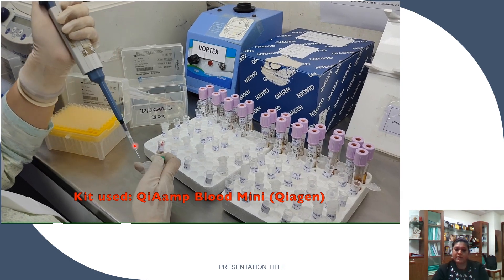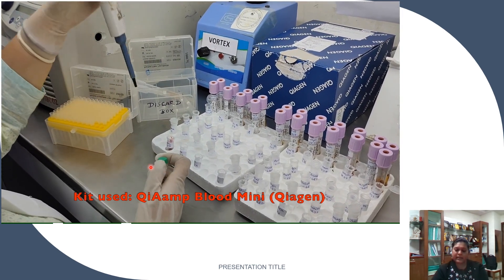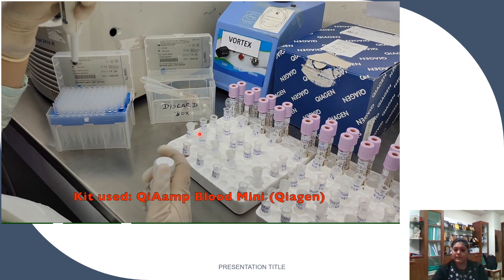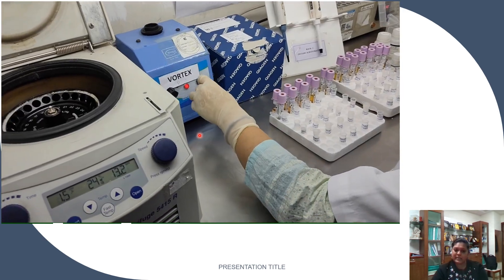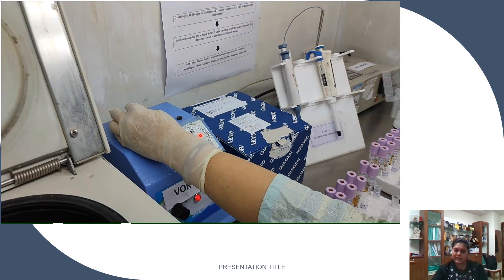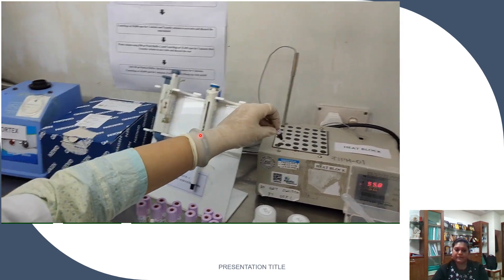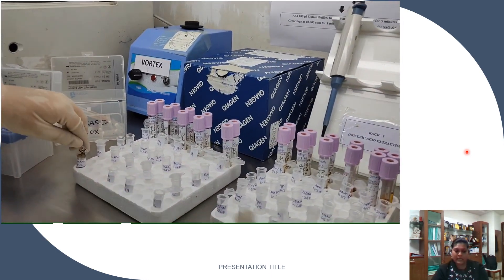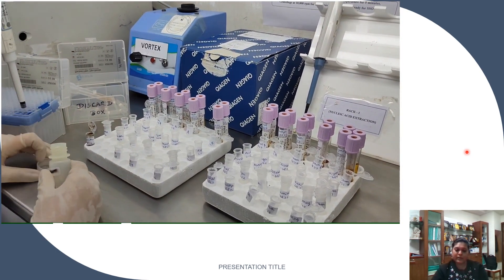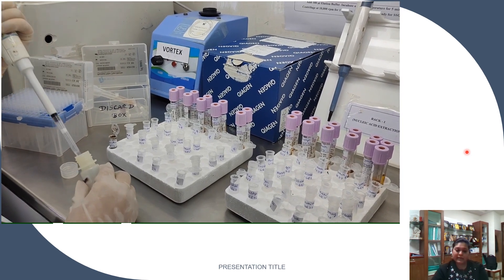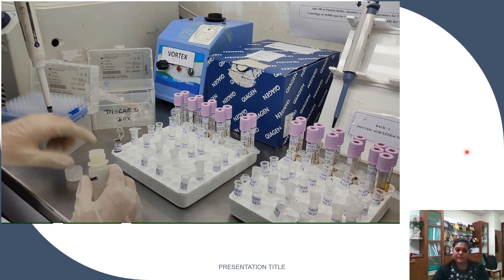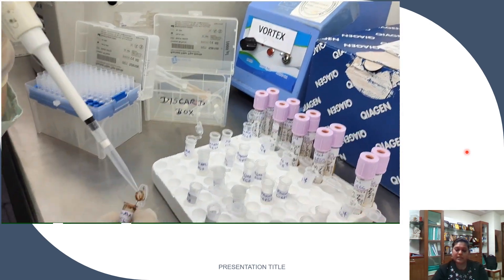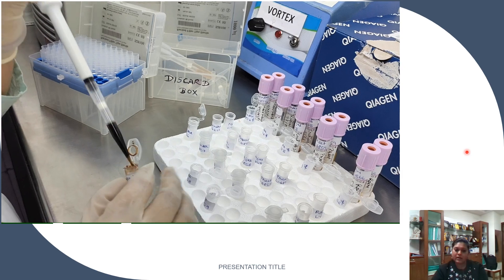Now that we have added the buffy coat, we will add the proteinase K provided in the kit — we are using the Qiagen DNA Mini Kit. After adding proteinase K, we add the genomic lysis buffer. Once both reagents are added, we vortex the mixture for homogenization, and the sample is incubated at 50 degrees Celsius for around 10 to 15 minutes. Once incubation is done, absolute ethanol — or alternatively isopropyl alcohol — is added to pellet the DNA and help it attach to the silica column. Homogenize again and transfer the whole mixture to the silica column.